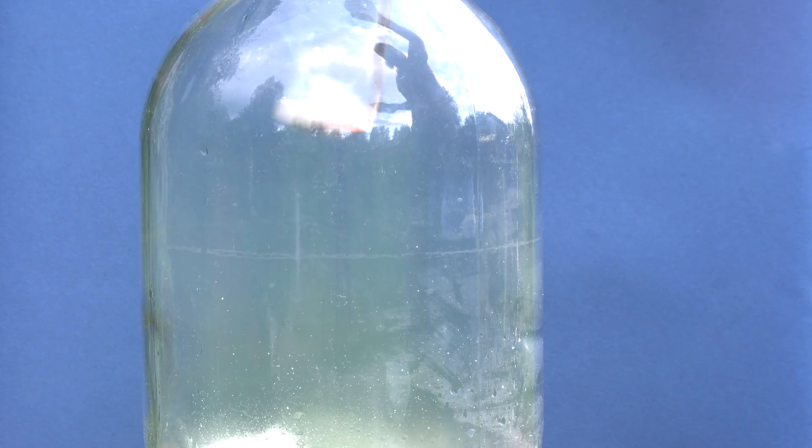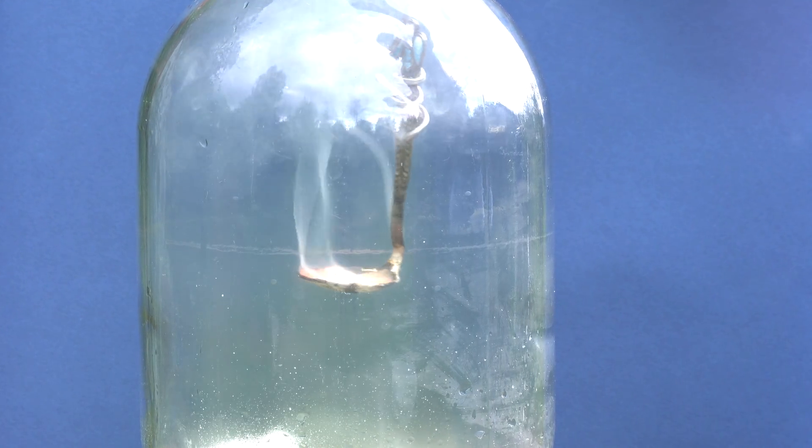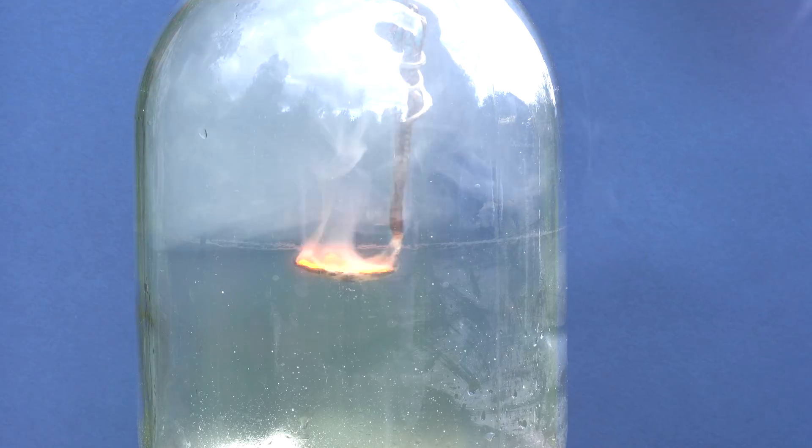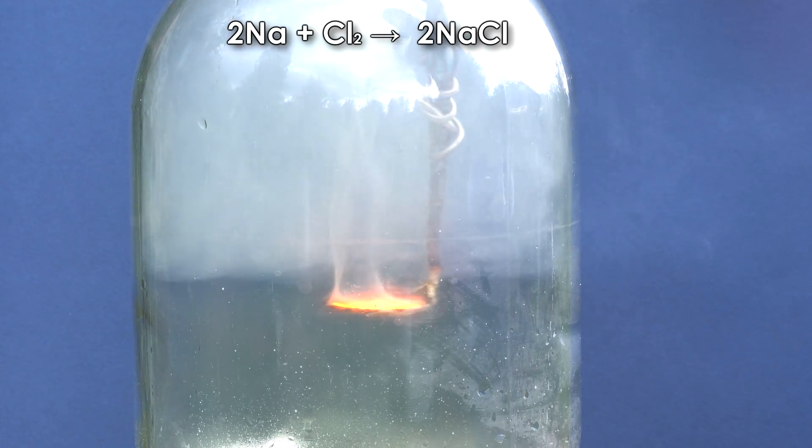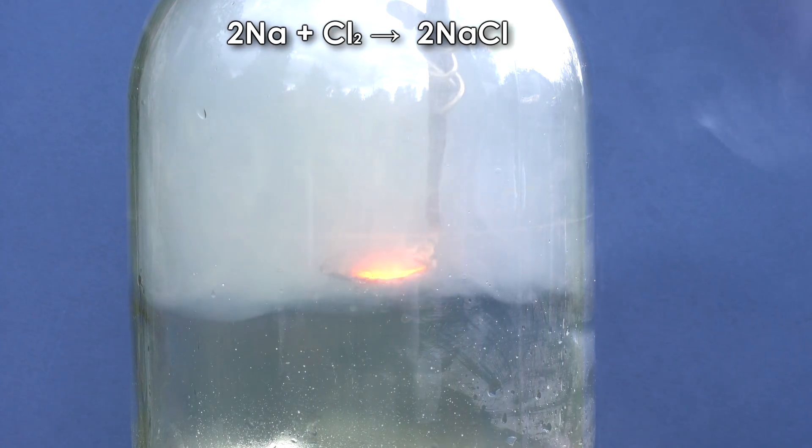The same will happen with metallic sodium, which when burned in pure chlorine, will form the well-known to everybody substance, sodium chloride, or the common table salt. This, in my opinion, is the most unusual way of obtaining table salt.